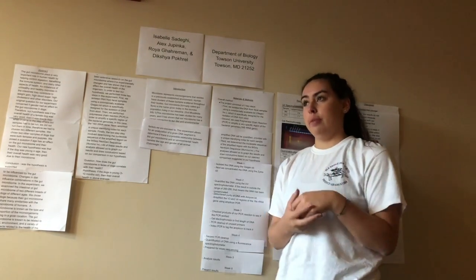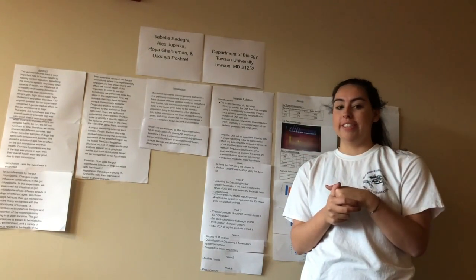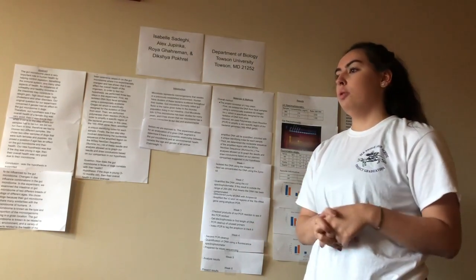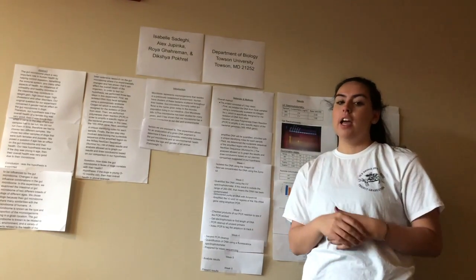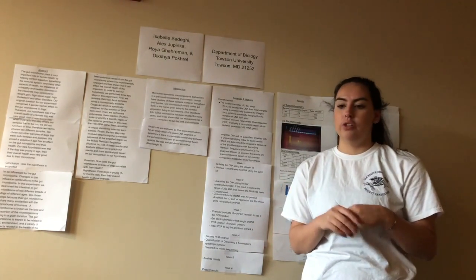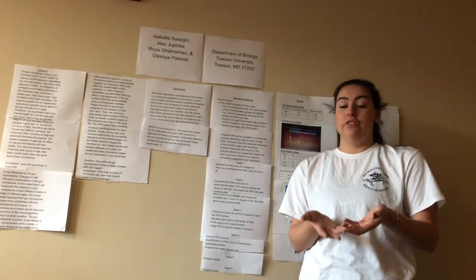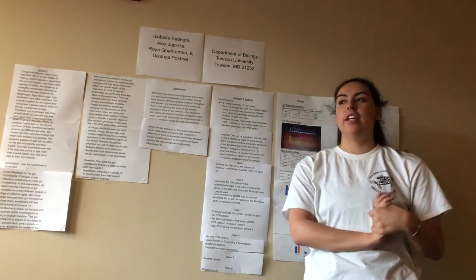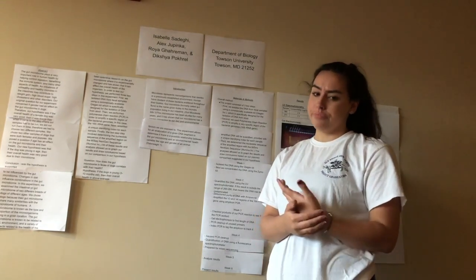Regarding our amplicon PCR results in the gel electrophoresis, they were unsuccessful, most likely because when we were pipetting into the wells, some of our samples leaked into neighboring wells, thus contaminating our results. We were mainly able to see this because, of all of our samples, the one with the highest percentage of DNA was our negative control, whereas the other ones did not have enough. So we're pretty sure that was the cross-contamination that we had.